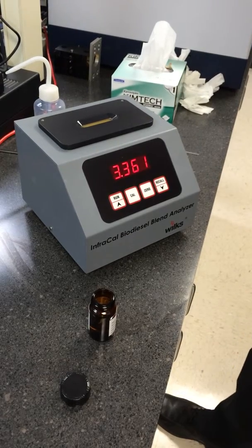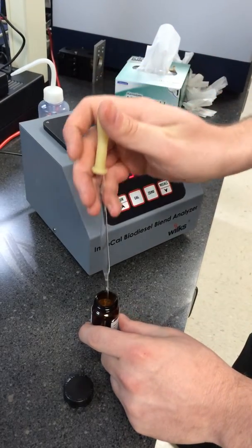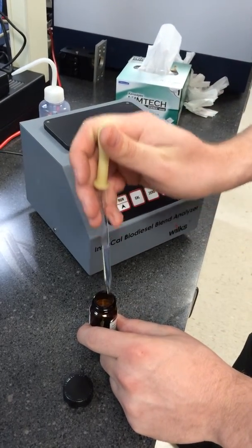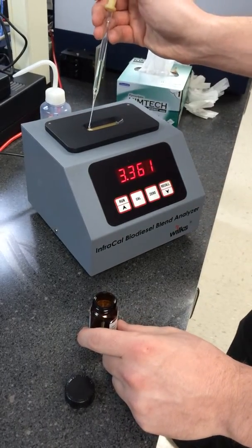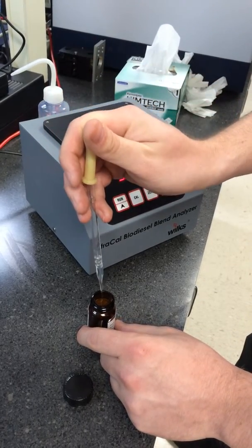Now you'll want to apply your sample to the crystal. To do so, take a pipette and apply it right to the crystal. Make sure to cover the entire crystal and remove any air bubbles.